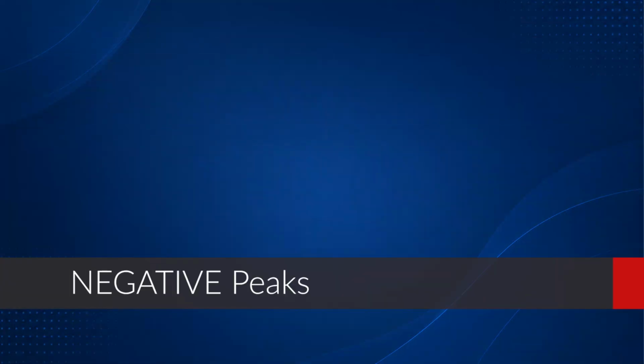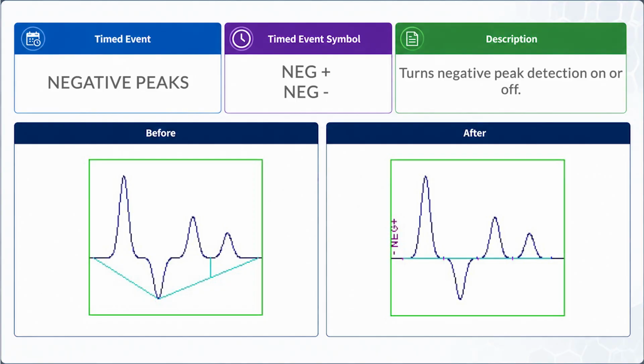Negative peaks. NEG plus turns negative peak detection on. NEG minus turns negative peak detection off. Most chromatographic peaks are positive peaks, but some methods or detector responses may produce negative peaks. When negative peak detection is required, NEG plus tells Chromperfect to look for negative peaks.